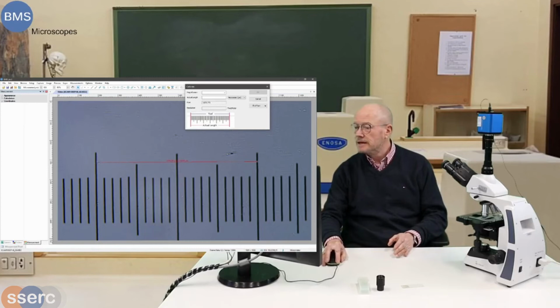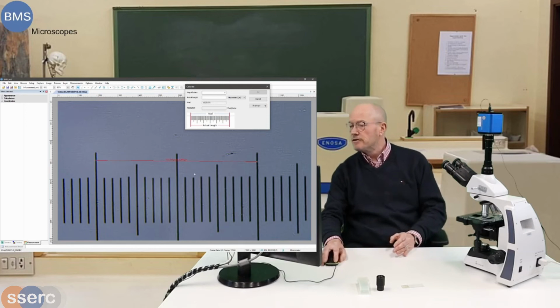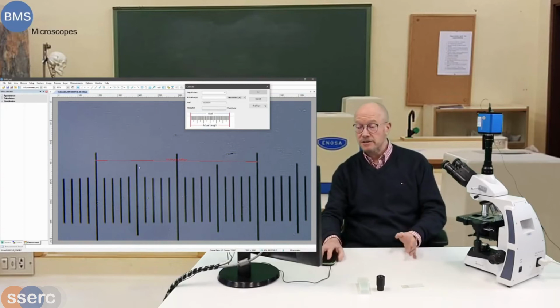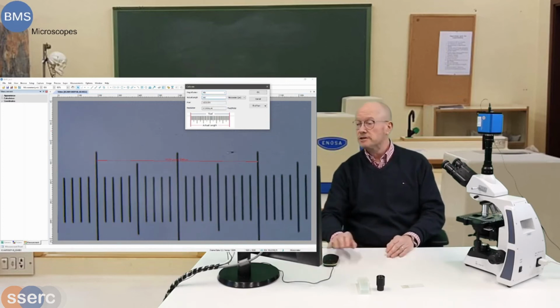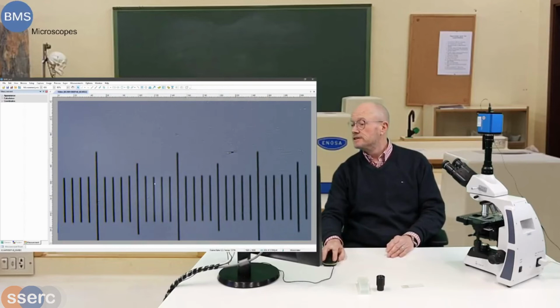Now making the line a tad larger again, so that it is going to fit straight on the bar here. From here to here, it's altogether 200 microns. Here, 100 micrometers. 100 is 1 bit. This is 200 micrometers. We say the magnification, we give it the 40 times. It's 200 micrometers. We say okay.